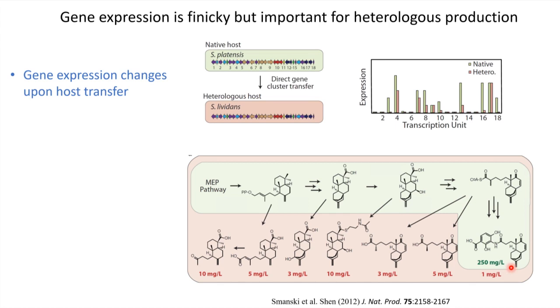One thing that we did in this experiment that most groups haven't done is we looked in the heterologous host for the production of additional metabolites. The structures of 6 of those metabolites that we isolated and solved are shown here. None of these were produced in the native host strain, and each is produced at greater titers than our desired final product. You can see from their structures that they bear resemblance to proposed pathway intermediates.